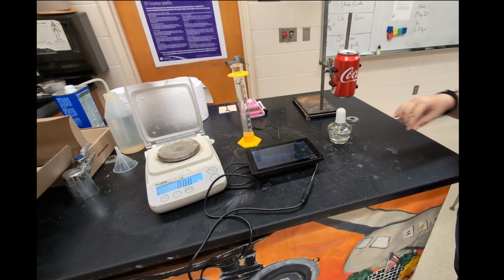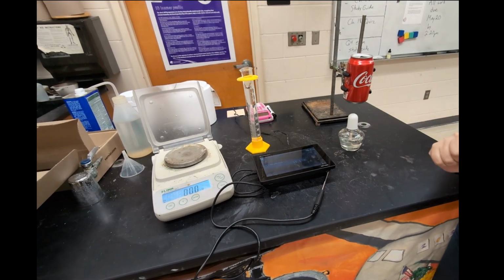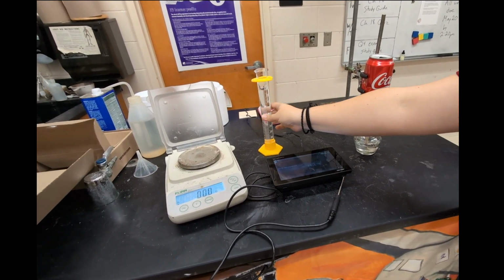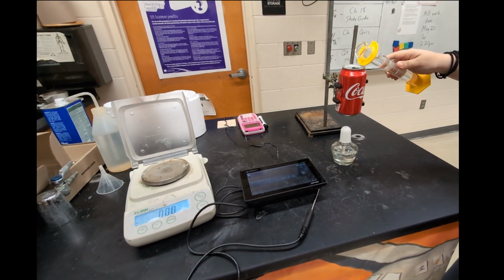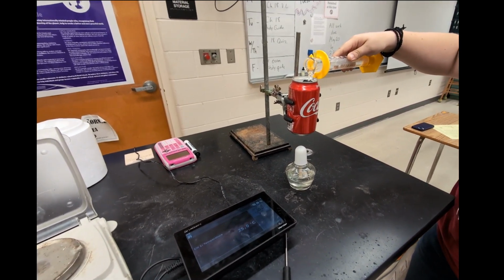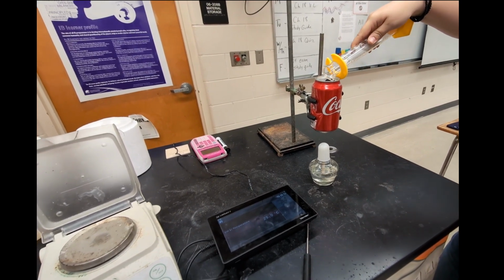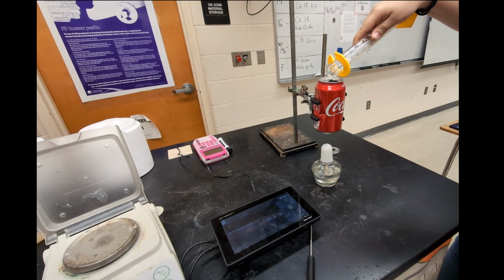For the procedure today, I've already measured out 100 milliliters of deionized water, and I'm going to add that into the soda can. And you want this to be fairly accurate because we're going to use that 100 milliliters in our calculations later.